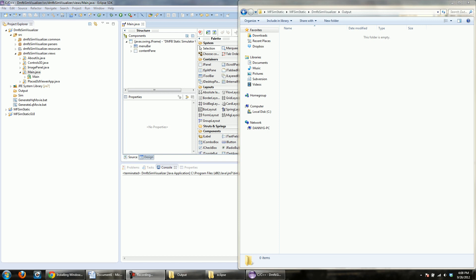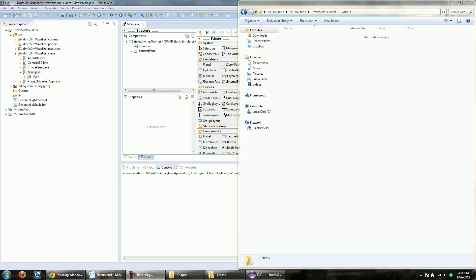Thanks again for checking out the UCR Digital Microfluidic Biochip Static Synthesis Simulator. If you need any more details on the setup, there should be a detailed help file. Go into the MFSimStatic folder and look for a help folder — in there you'll find help files that give a written description of a lot of the things covered in this video.